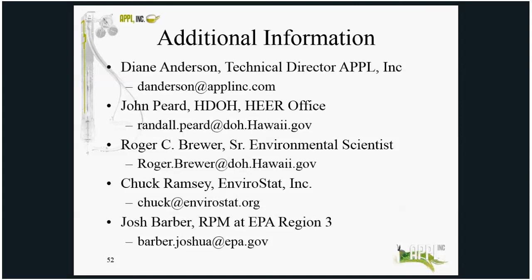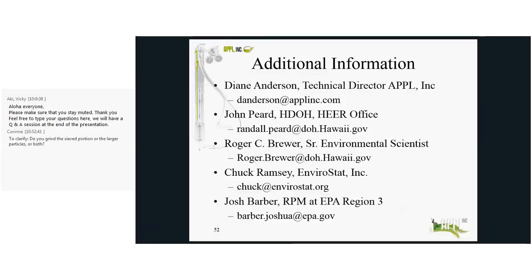Recently we had a set of samples where we were at 25 to 30%, and at that point we look at what the QSM says, and it says 20%, so we call the customer and say, hey, this is what's happened, and then they'll tell us what they want us to do from there.